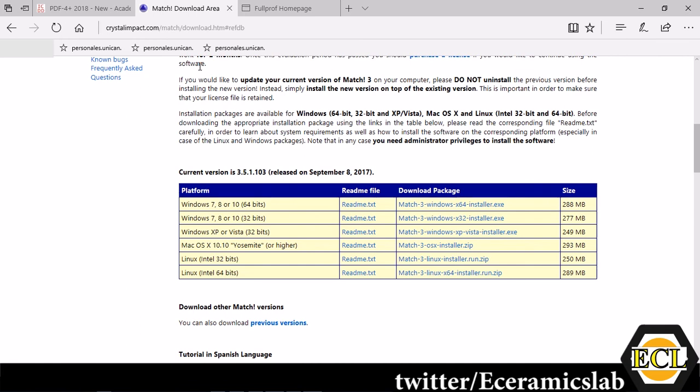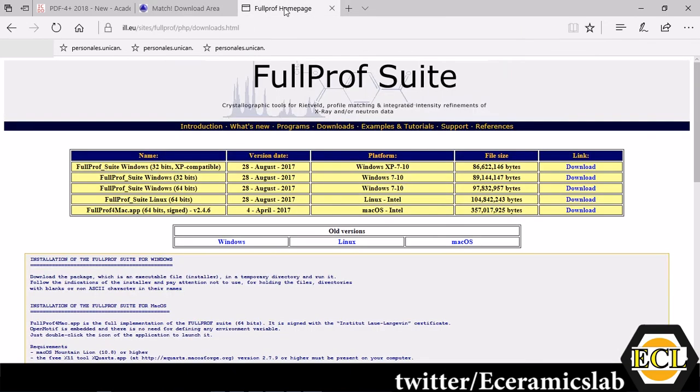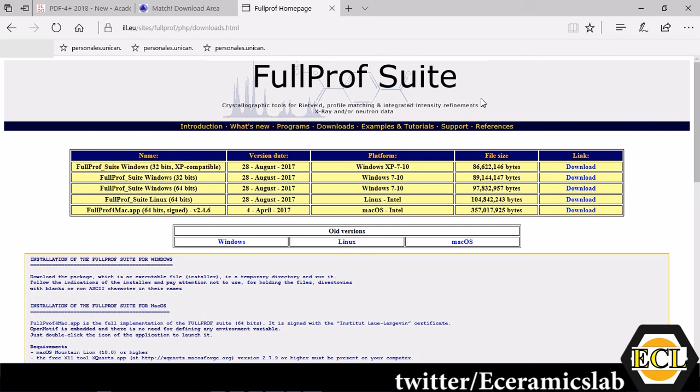It can be Crystal Open Database or it can be ICDD PDF4 database and after this you have to have a pre-installed FullProf version. This is required for Rietveld refinement using MATCH. MATCH uses this software FullProf to do the Rietveld refinement in the background. You have to have this software as well pre-installed only then you can use Rietveld refinement.